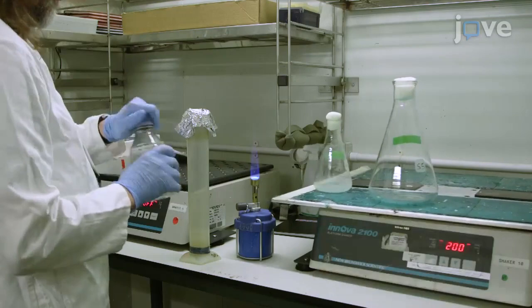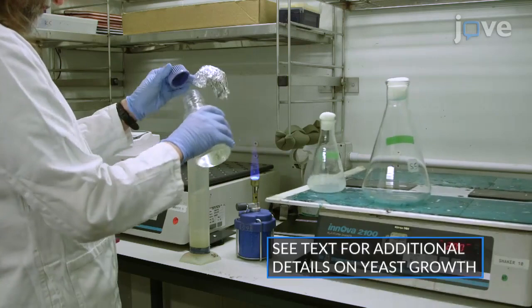In a fume hood, add methanol equivalent to 30 to 50 percent of the intended sample volume to a 50 milliliter tube.